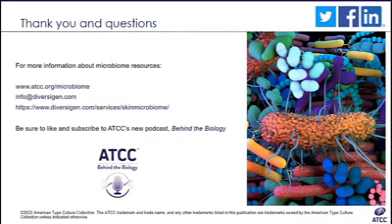As a lot of you may know, for the longest time, microbiome data, including skin microbiome studies, were published without controls. So I would say that moving forward, adding a standard like a mock community is something that should probably be required somehow for publication, just to make sure that there are no biases related to any steps of your pipeline. Also, in the case of skin microbiome, because again, it's a low biomass sample, it is going to be essential to add a blank or an extraction control just to make sure that there is little to no background noise or any bacteria that are affecting your skin microbiome profiles.